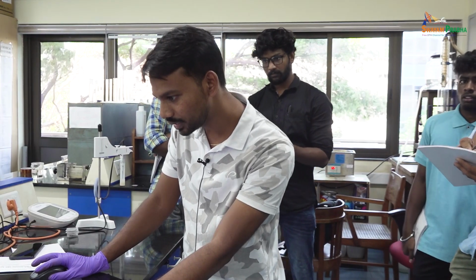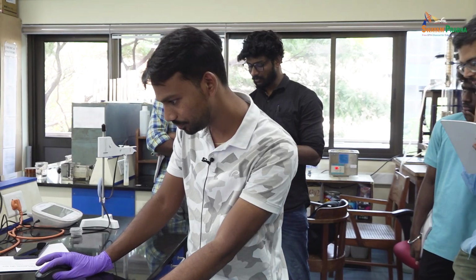Okay, now we will do it for the NaCl solution.